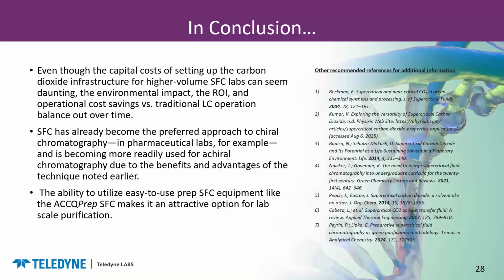It's also become more readily used for achiral, and because there's a whole plethora of achiral stationary phases designed specifically for SFC use, that makes a screening approach and method development approach to that feasible, and you can easily run a lot of samples using this versus HPLC. And because systems are much easier to use, like our system, this day and age, it definitely belongs in most laboratories today.